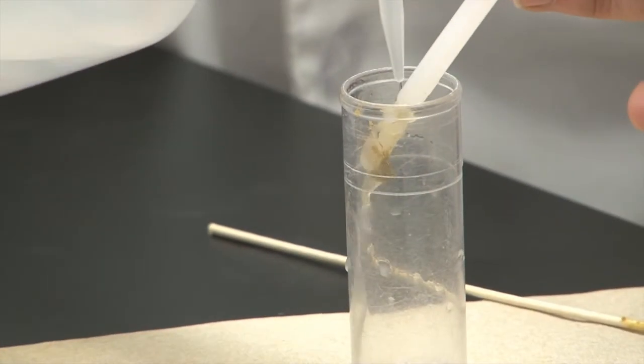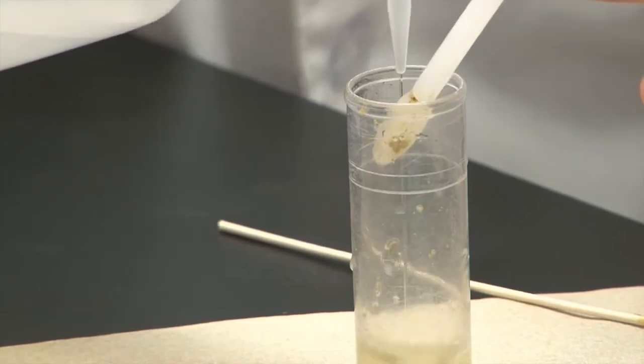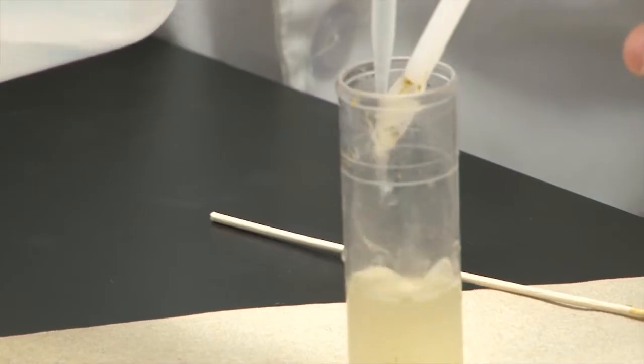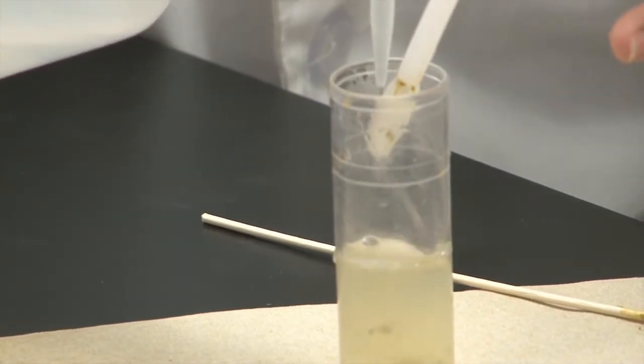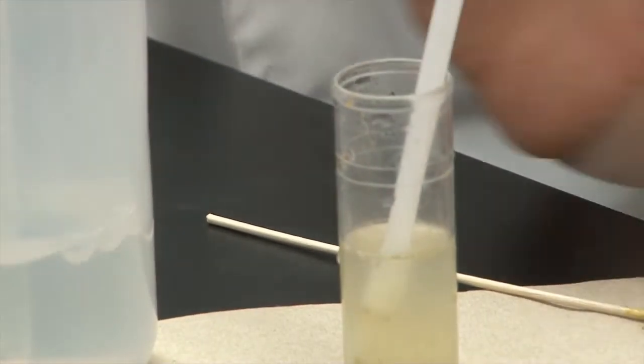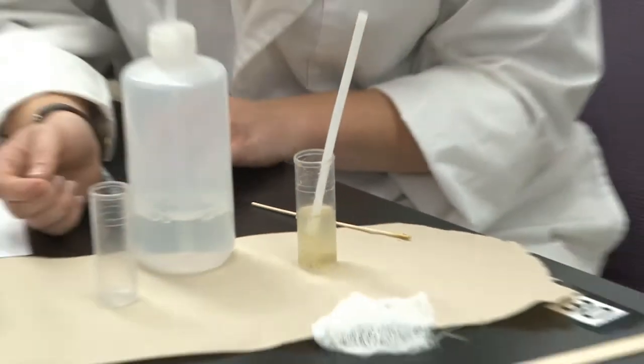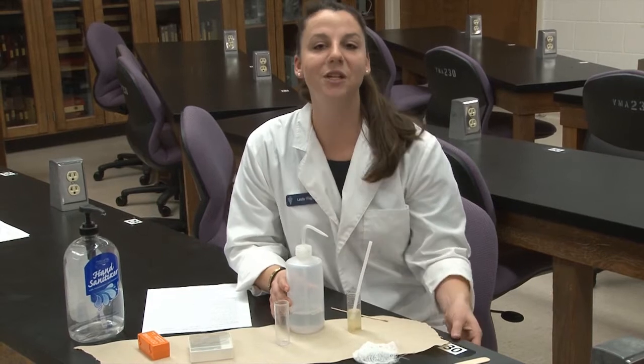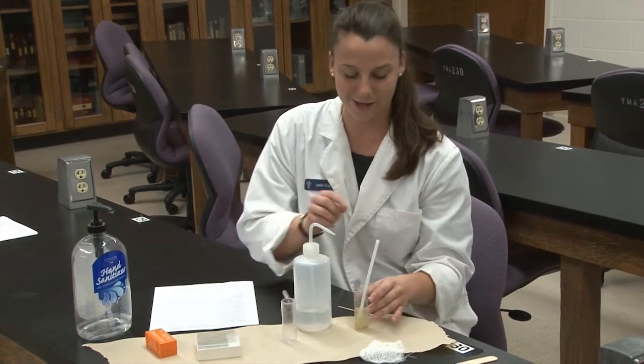You're going to fill this first vial with your sample about halfway with water or with flotation material. Some clinics prefer to use different flotations. You'll see sodium chloride very commonly, which is just salt water. Sometimes you see zinc sulfate, and sometimes you even see sugar water, which is really thick and kind of fun to work with.